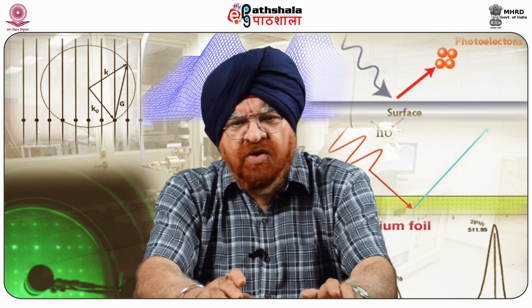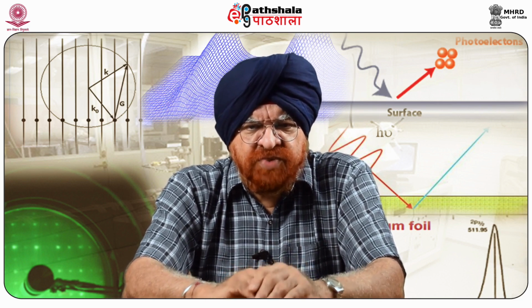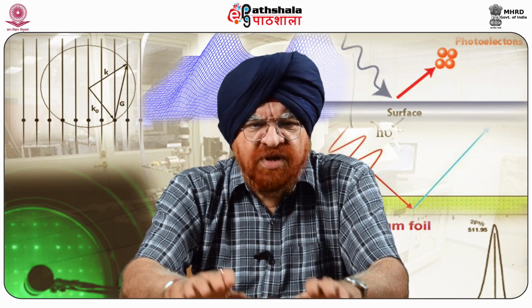These features enable AFM to produce nanometer to micron scale images of, for example, topography, adhesion patterns, friction, and compliance, and thus make AFM an excellent characterization technique for fields ranging from material science to biology.